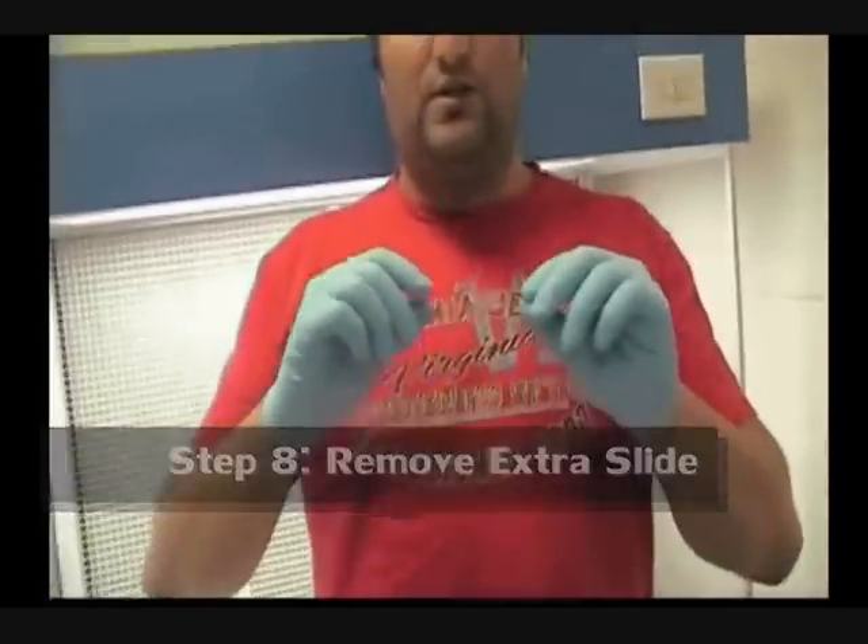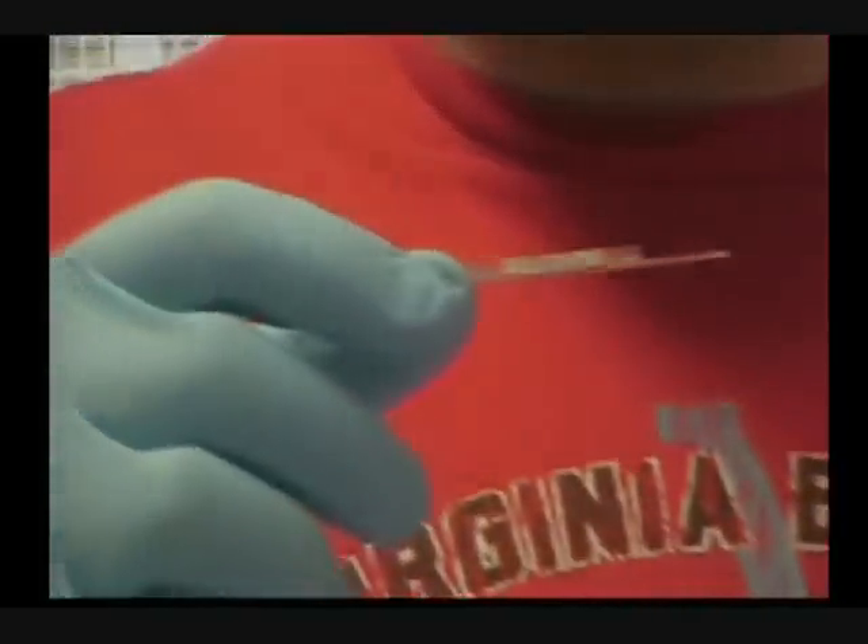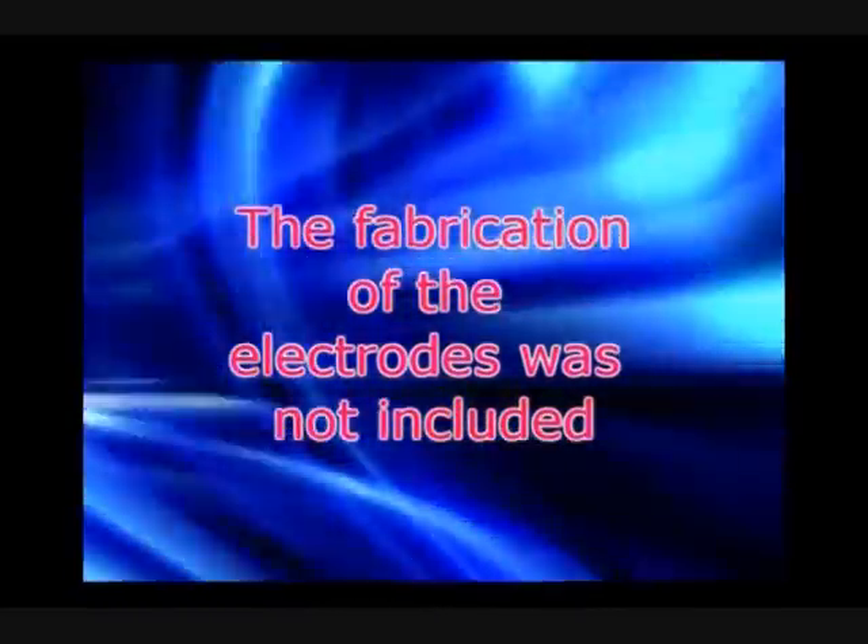So our device is ready for the experiments. And now I am gonna place the camera on top of my chip. And now the setup is ready for the device.